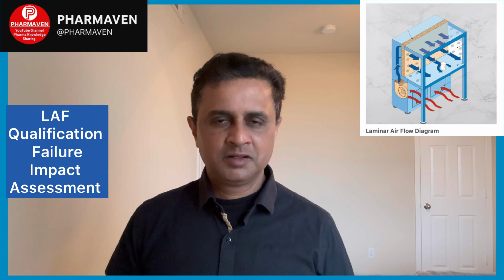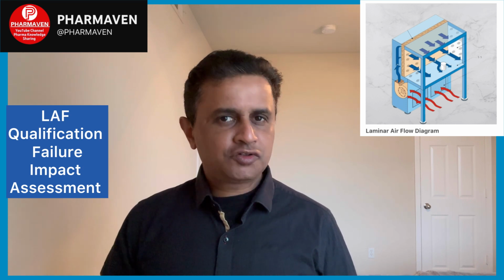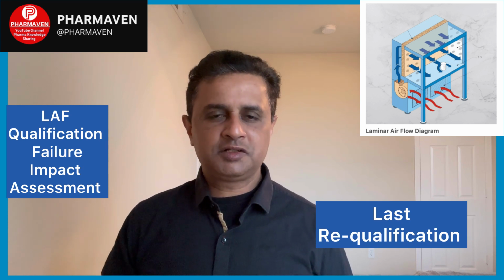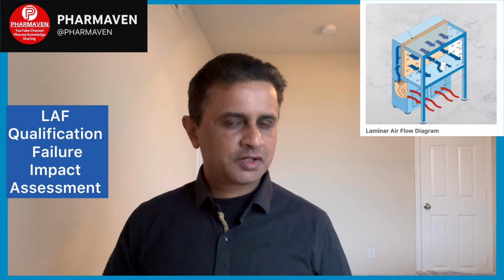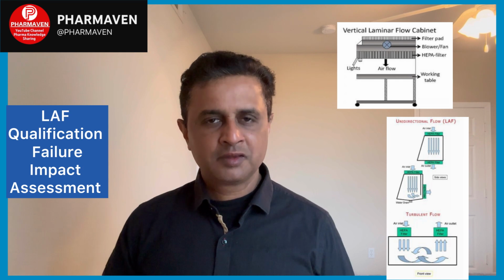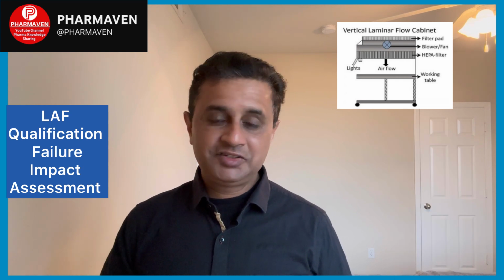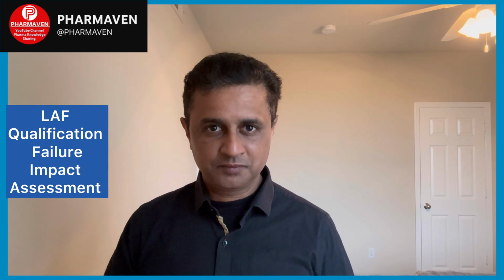Let's understand. First and foremost, see the results of the previous qualification. Was there any problem with the previous qualification? Was there any change made? Just review the previous requalification of that particular laminar airflow and see whether there was any change or any problem during the last requalification.